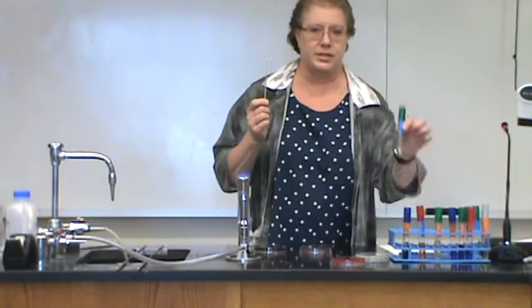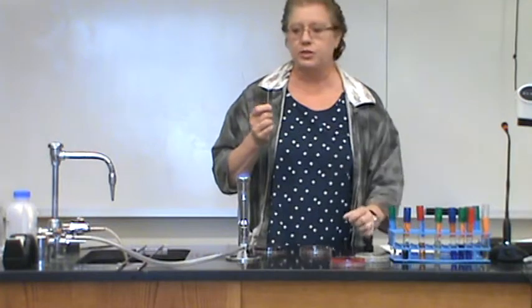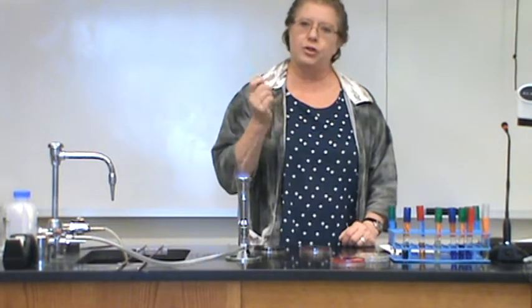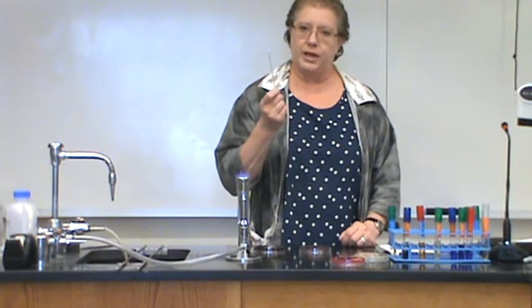And then this can be reused since you are using the same bacteria each time, as long as you didn't contaminate it in some way by putting it down on the table or getting it on your lab coat or something. So you can go ahead and reuse this. If you need a new one, just simply discard it in the proper disposal and then get a new one. But we haven't contaminated this, so we're going to go ahead and keep using it.